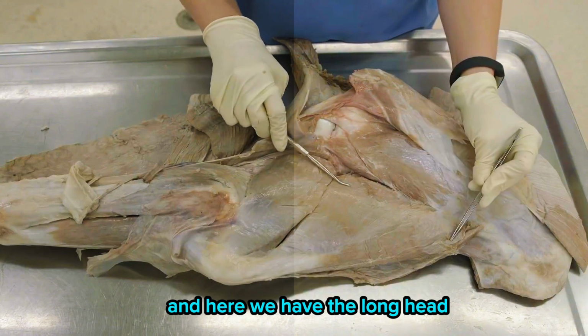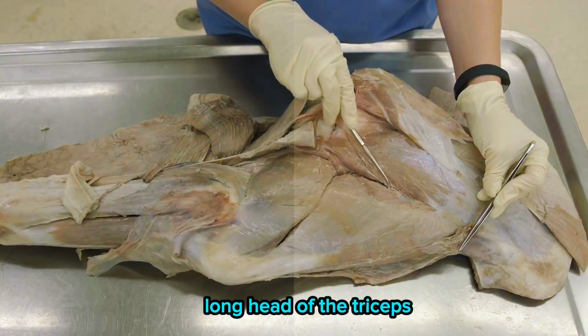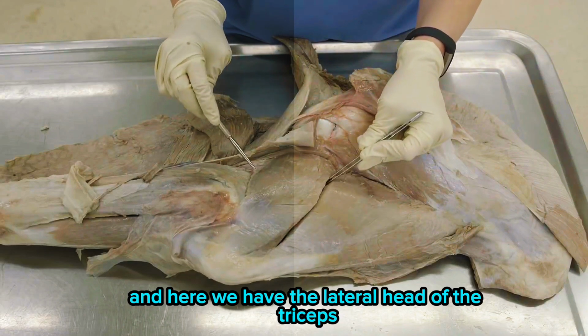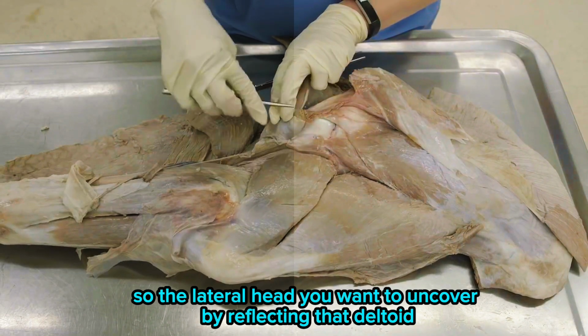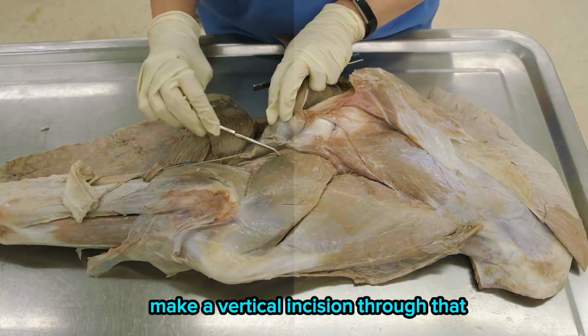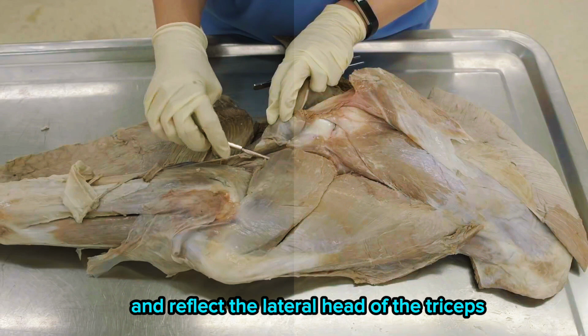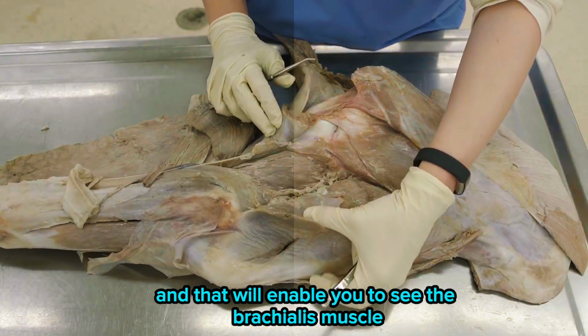And here we have the long head. So long head is very large, long head of the triceps. And here we have the lateral head of the triceps. So the lateral head you want to uncover by reflecting that deltoideus, and then you want to cut it, make a vertical incision through that, and reflect the lateral head of the triceps. And that will enable you to see the brachialis muscle.